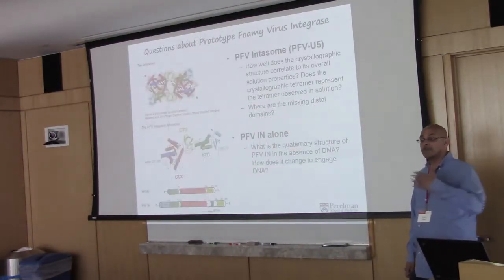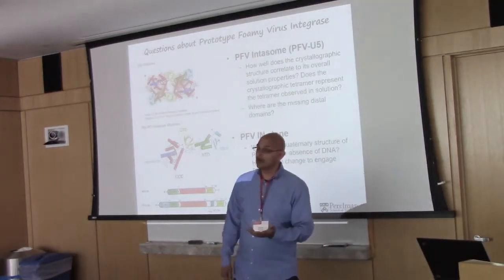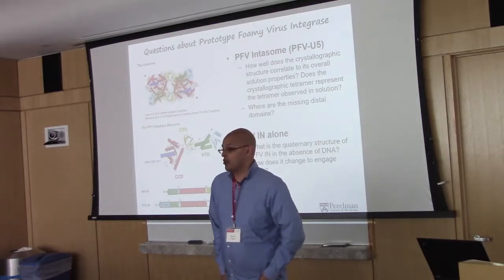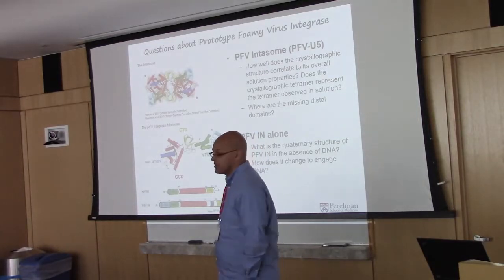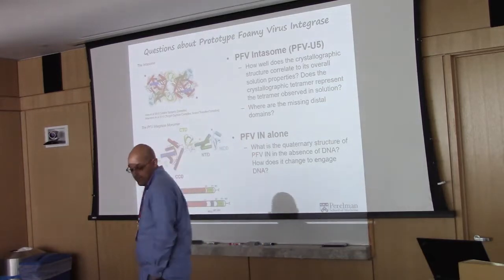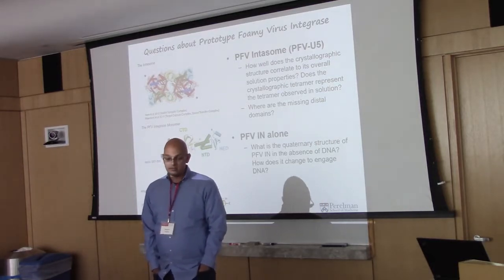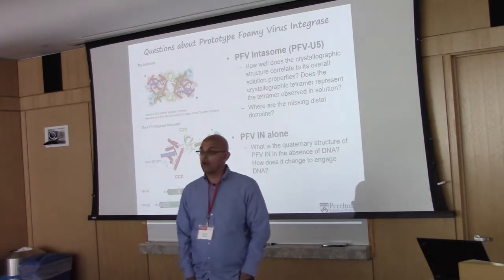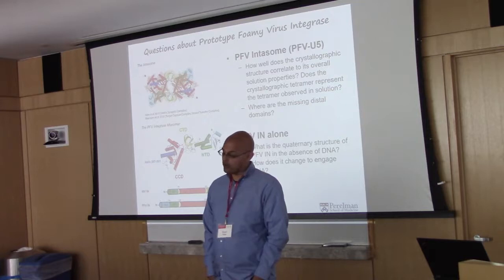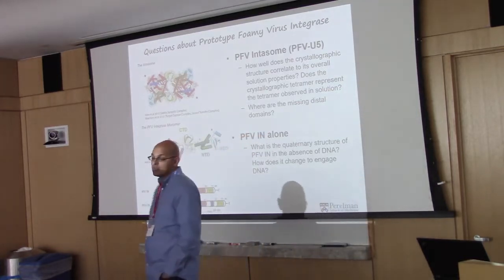So I'm going to use the first research problem here. I spend most of my time researching HIV integrase, which is one of only 3 enzymes in the retroviral genome. A quite literally 30-year pursuit in this community is getting crystal structures of the full-length intact proteins. It has eluded such analyses to date, where you can see all 3 domains clearly resolved, simply because this protein is the devil's protein. It just wants to aggregate. You need salt, glycerol, CHAPS to keep it in solution.